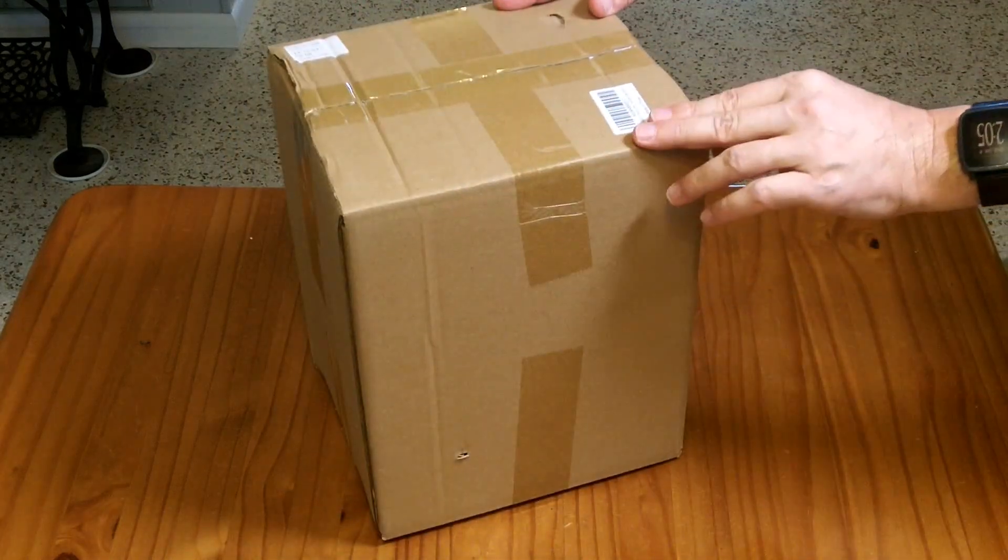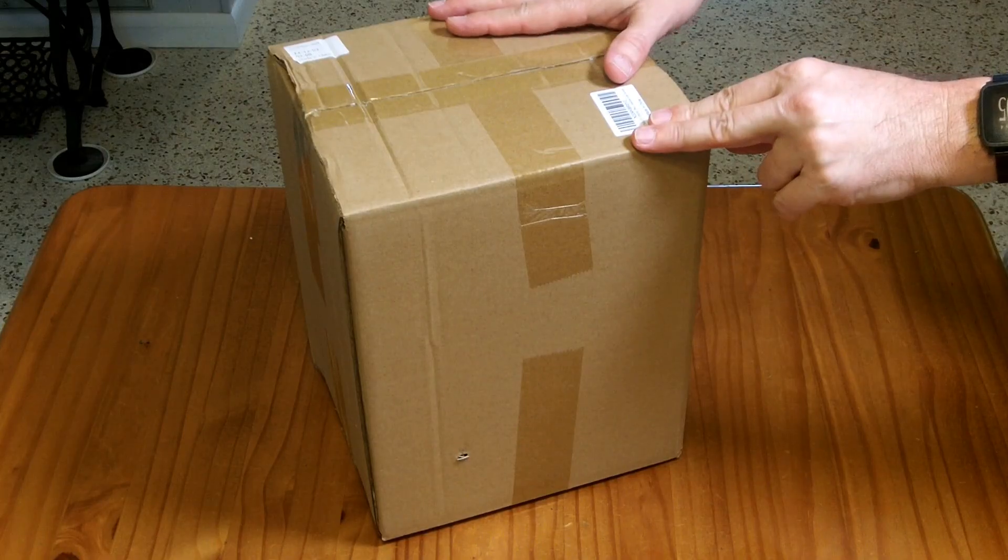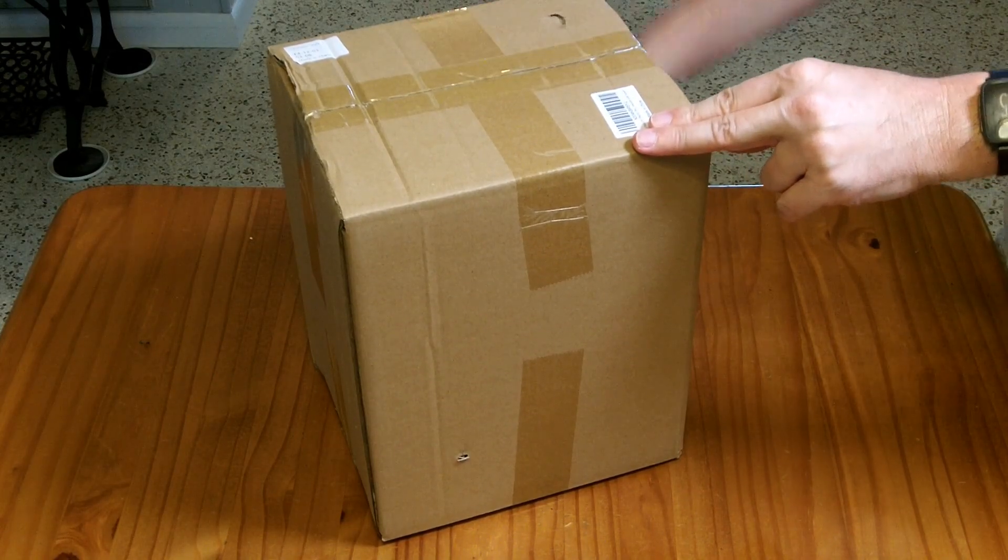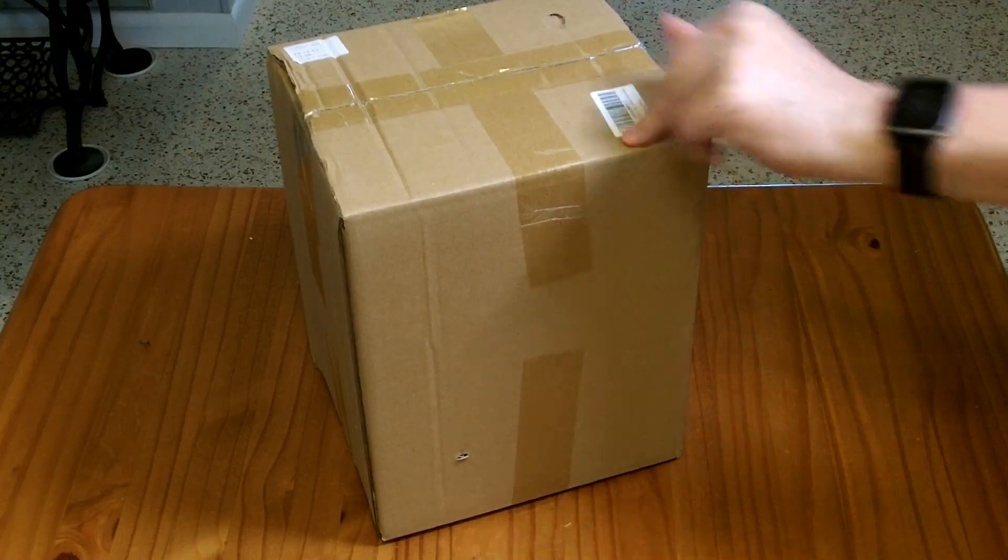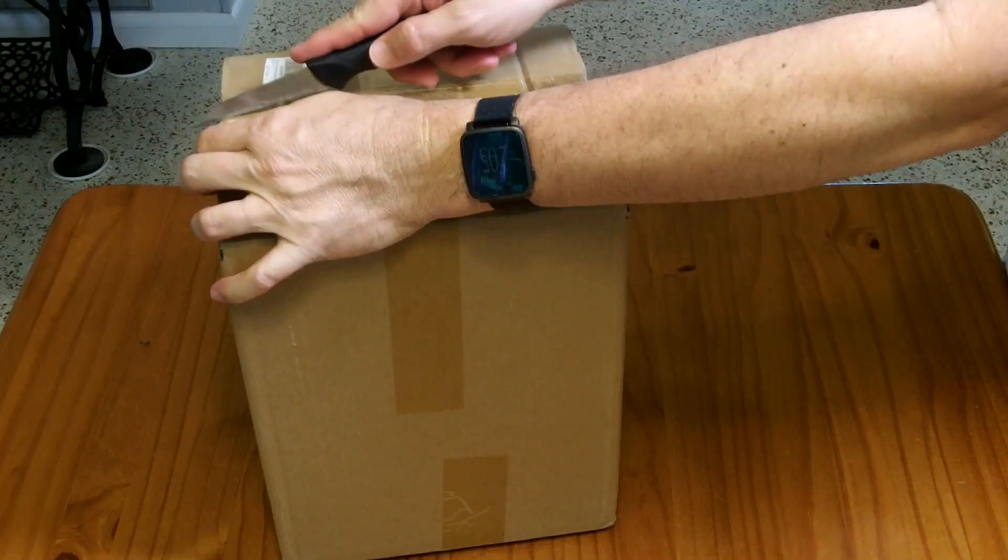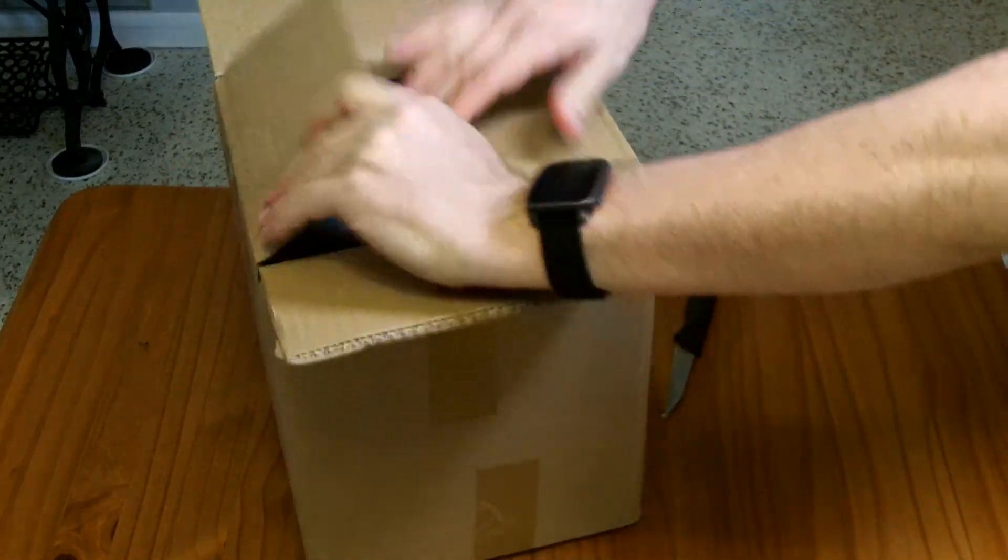This is a digital microscope, which basically means they have a screen and camera integrated into an eyepiece. I was sent this to review for free. If you wanted to purchase it, the MSRP is about $200. They haven't paid me for my review, and my opinions remain my own.